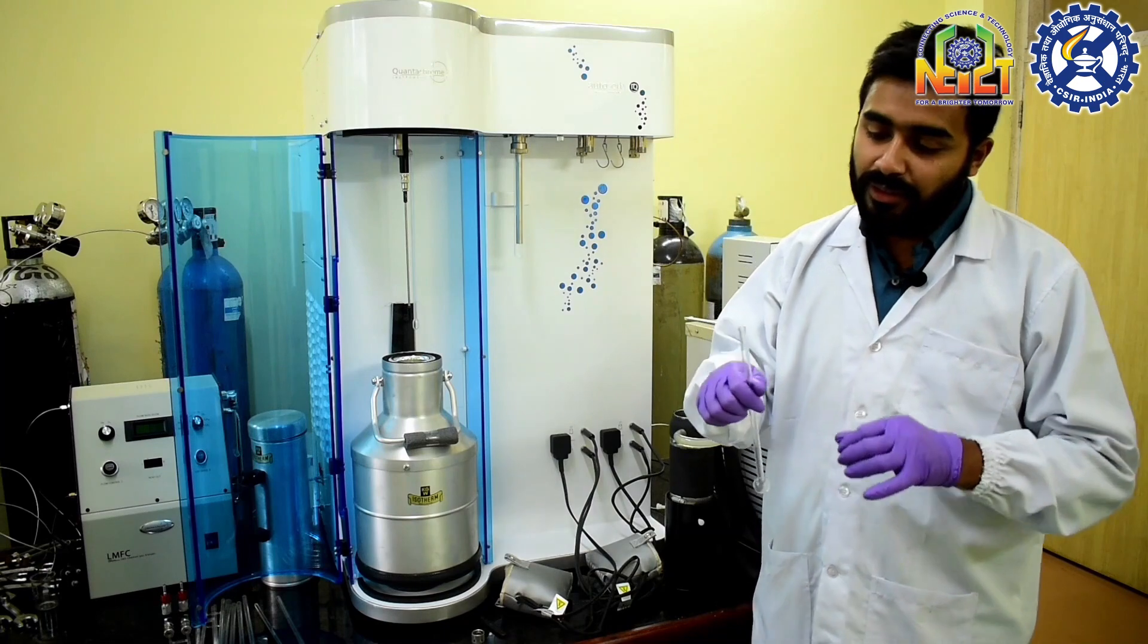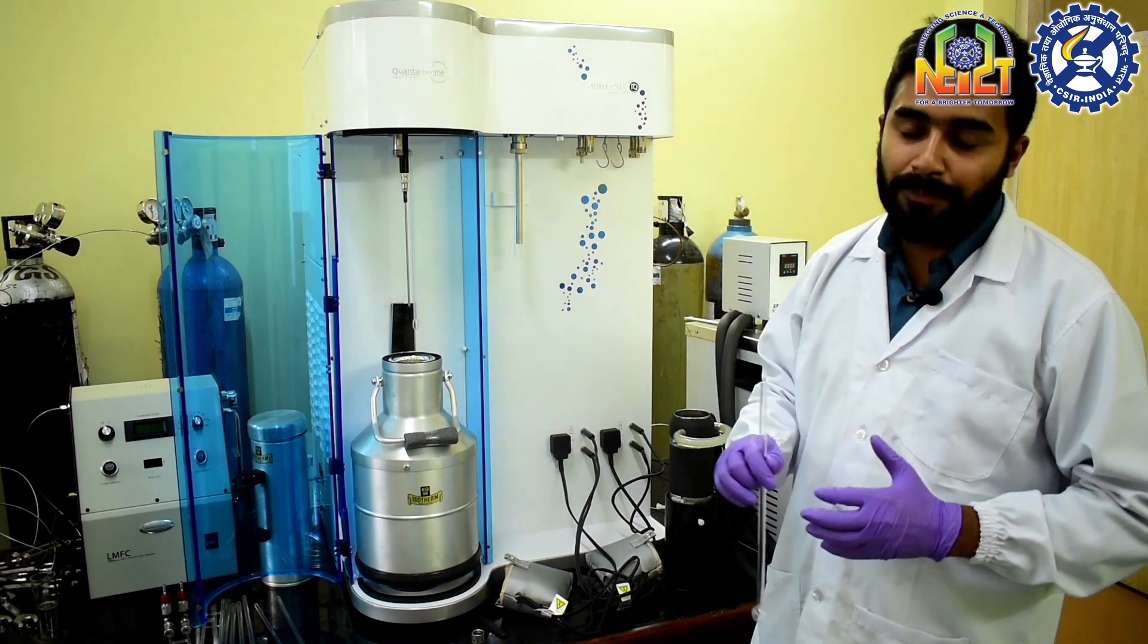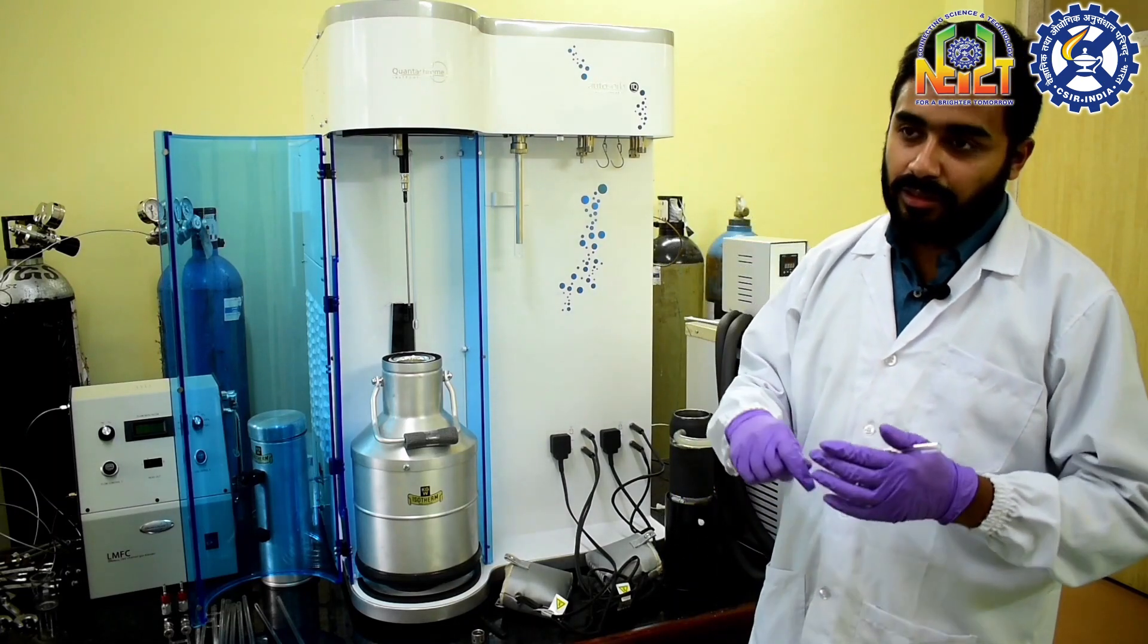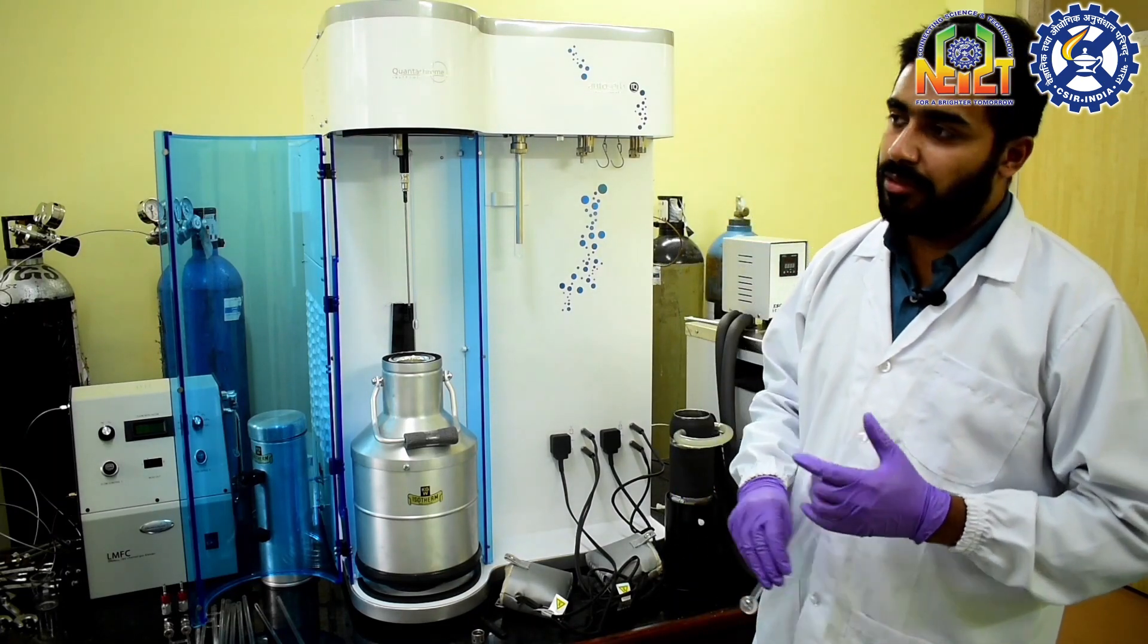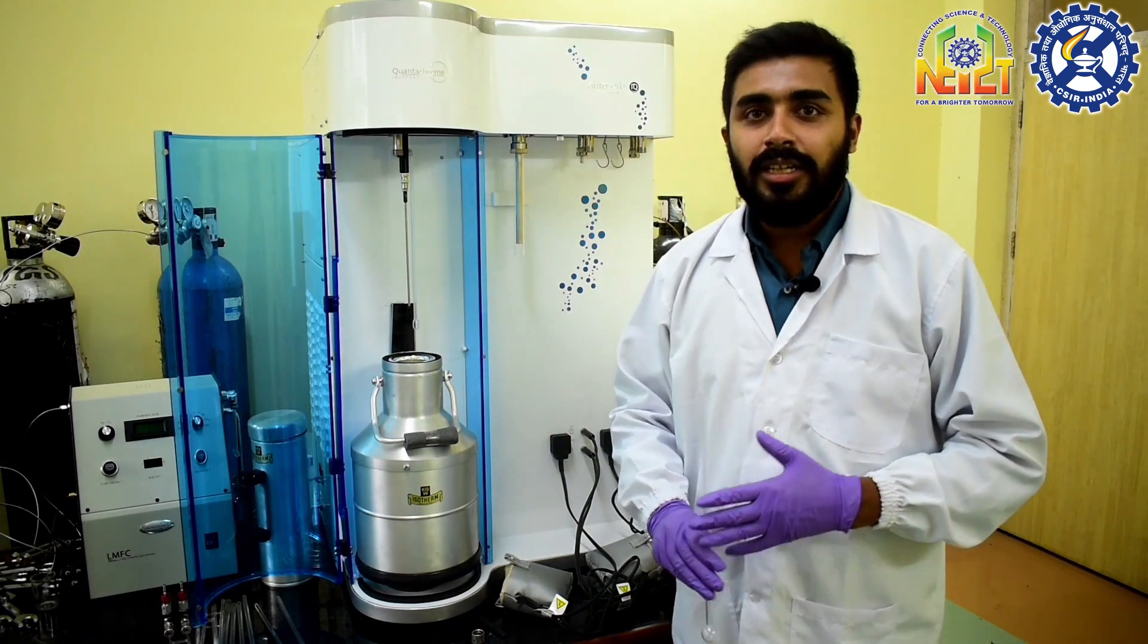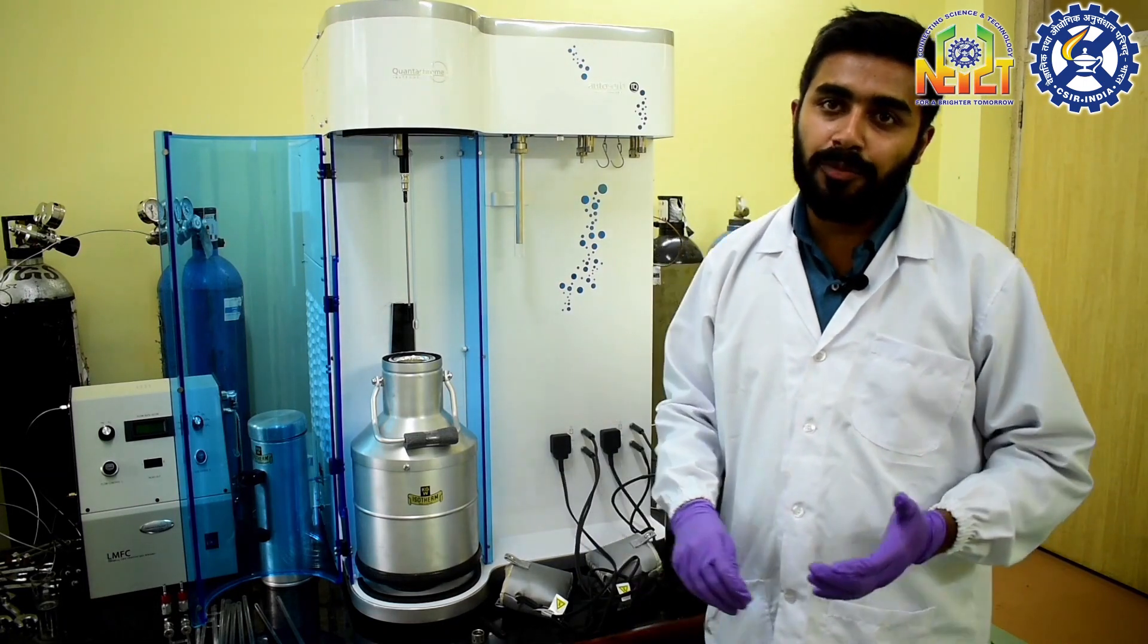These are sample cells. We have basically three types of sample cells of 6 mm, 9 mm and 12 mm diameter. For the samples like activated carbon nanoparticles we use 6 mm and 9 mm sample cells. But for the samples like thin films we have to use the sample cells of diameter 12 mm because they have very low substance.